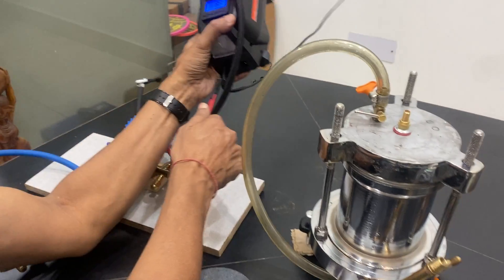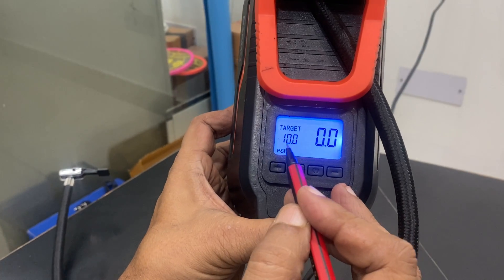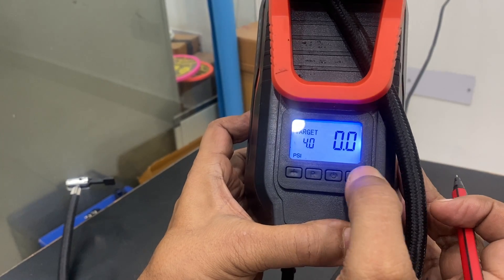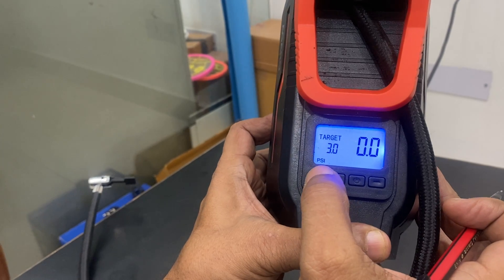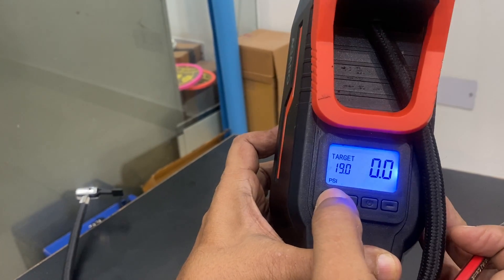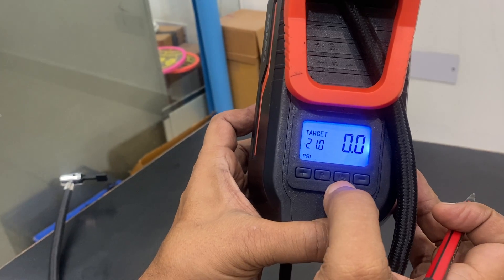This pump can work up to 220 volt mains and has a target of 10 psi. I can decrease it to 5 psi, 4 psi, or 1 psi, and it can go up to 150 psi. I can make it 10, 20, 30, and so on — up to 150 psi.